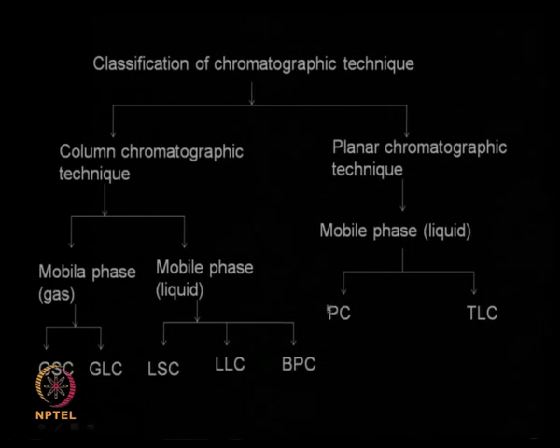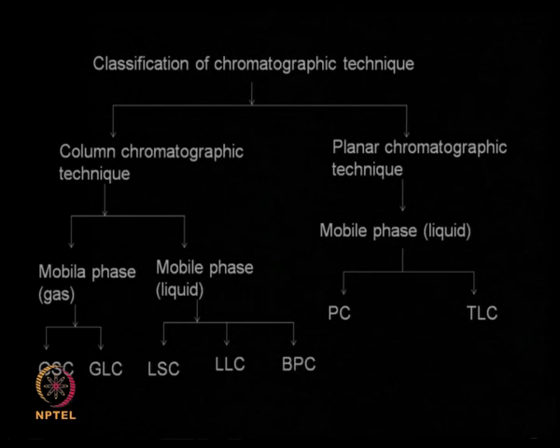If you look at chromatography many years back, organic chemists used to use something called thin layer chromatography to separate out components in a reaction mixture and possibly even identify whether the product has formed. If they have an authentic sample of the product, they will simultaneously run the thin layer chromatography and see whether the product has formed. So organic chemists have been using this chromatography for a very long time.